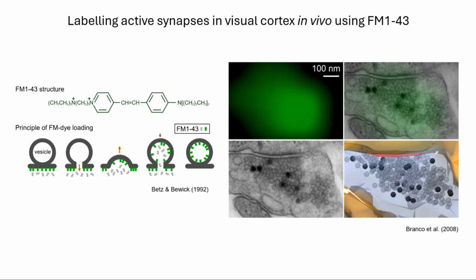If we would look at the presynaptic terminal loaded with dye, all we would see is just a blob of greenness. Converting this dye allows us to do a precise anatomical segmentation and to precisely count every photoconverted vesicle in each presynaptic terminal, and that would be the readout of the synaptic bouton activity.